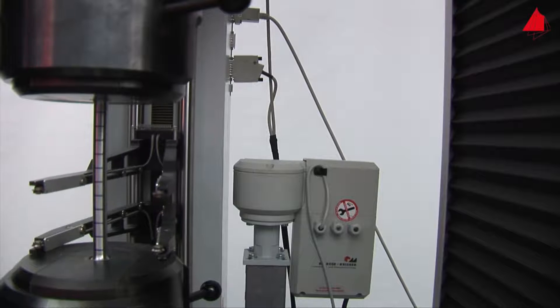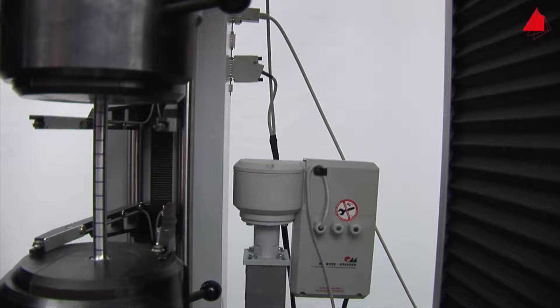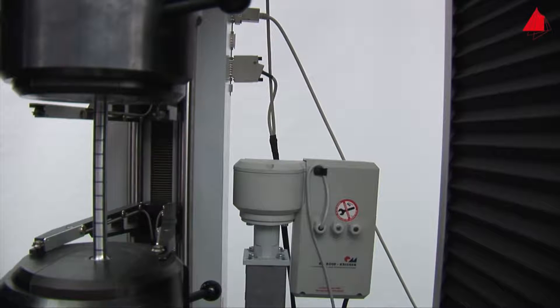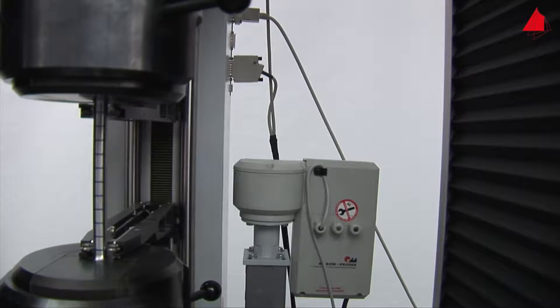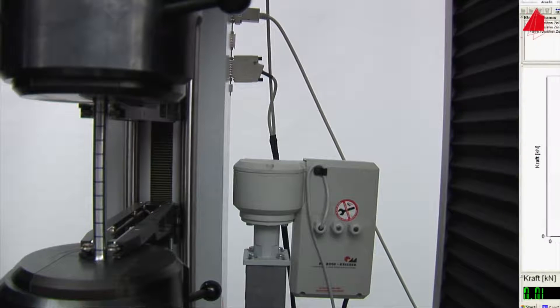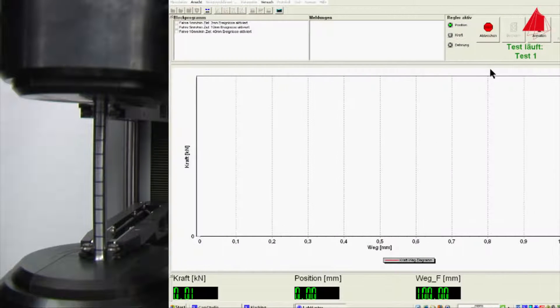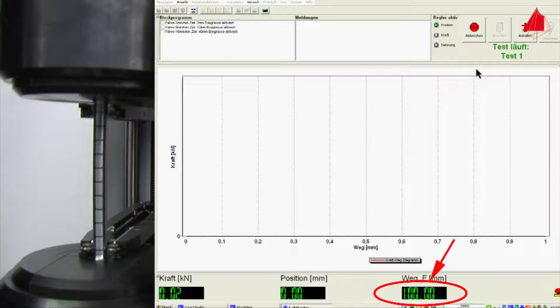Ready. The test starts and the extensometer sensor arms are carefully pressed onto the test piece. This way the gauge length can be measured throughout the whole tensile test. The gauge length is displayed at the bottom right hand corner of the screen. At the beginning it amounts to a hundred millimeters.